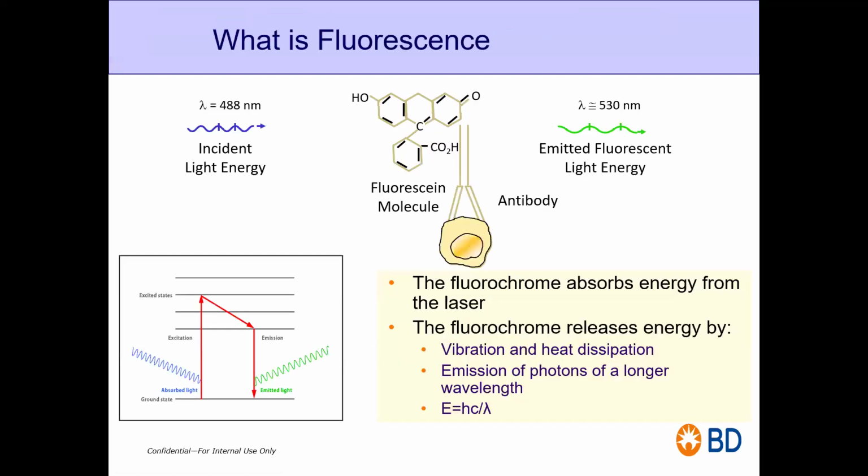So now let's come to the fluorescence. You must have learned in your 12th class that every particle has its ground state, and when it absorbs energy, it goes to its excited state. And then after a point of time, because it won't be staying there for long, it will come back to its original state, but when it comes back, it will release some energy. How does it help us here?